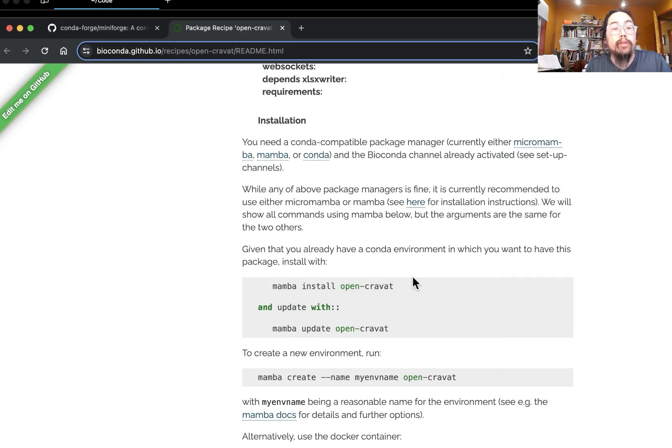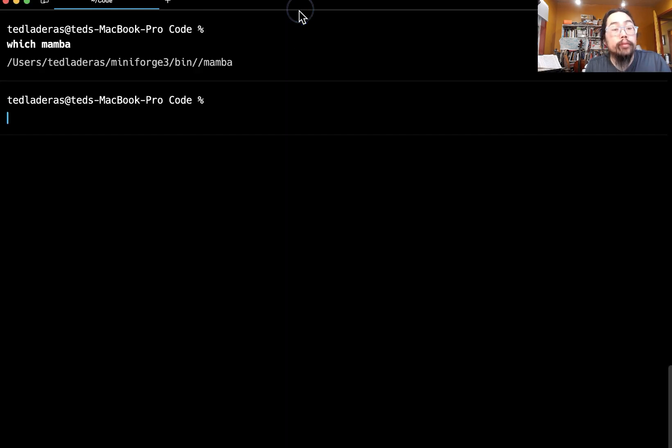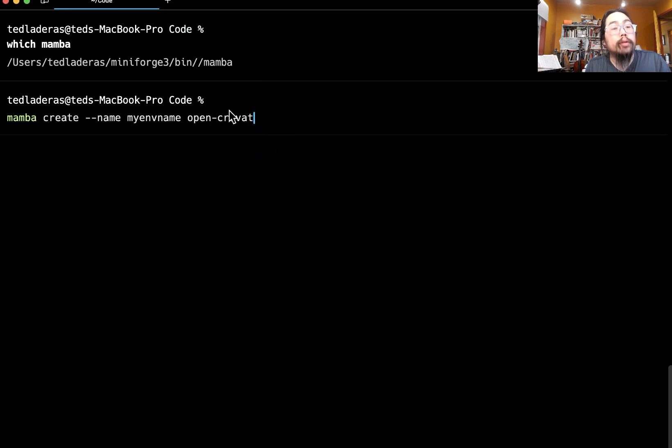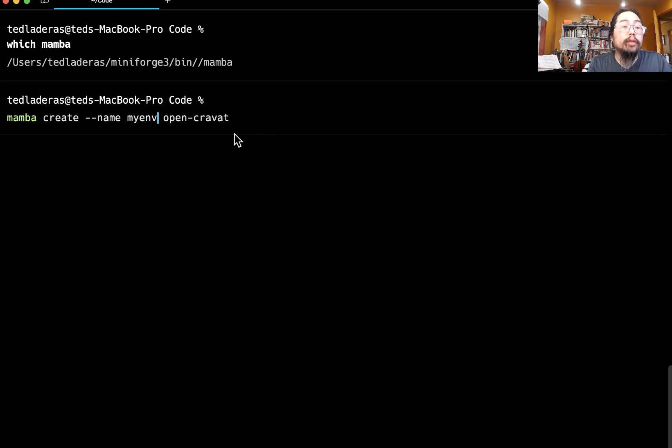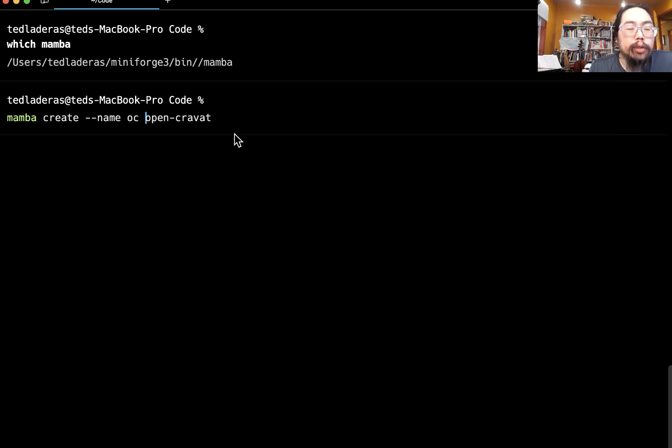So remember, it's going to be this mamba create dash name. So let's do that. So I'm going to name this environment OC. So again, this is going to create the environment and it's also going to install open cravat into it.